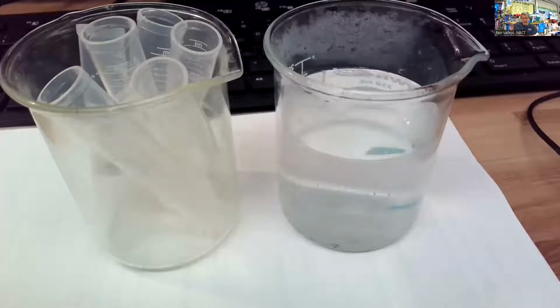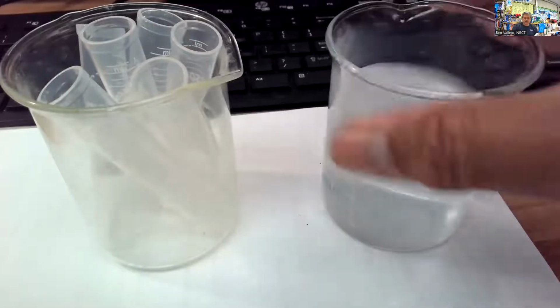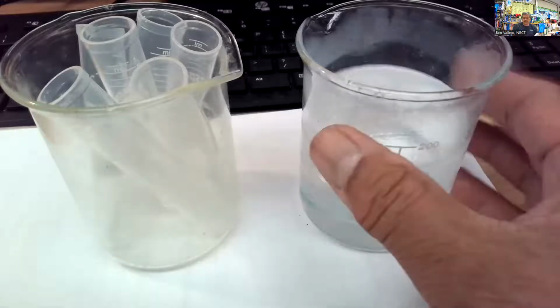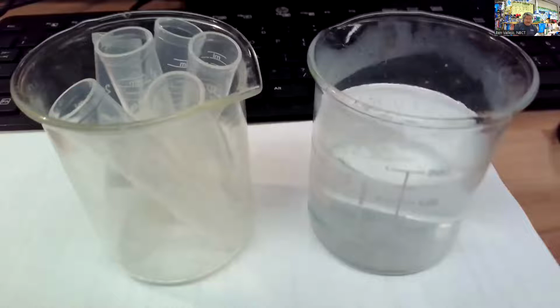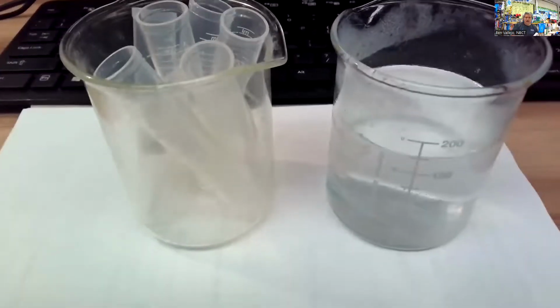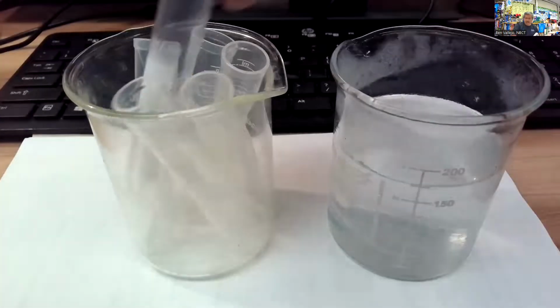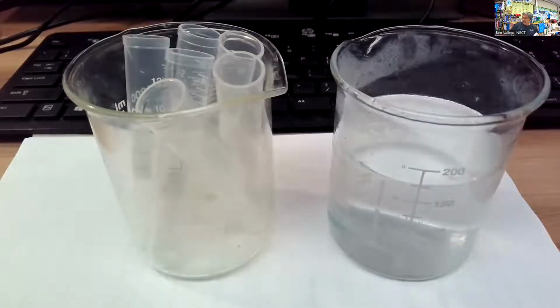All righty, guys, I'm back and I have my hot water right here. I just put the water in the microwave for 2 minutes and it's not boiling, but it is hot. You might see a little bit of steam coming off of that. So that is the hot water. What I'm doing on the Benedict's test is going to add the different chemicals to the test tubes. And then I am going to add 5 drops of the Benedict solution.